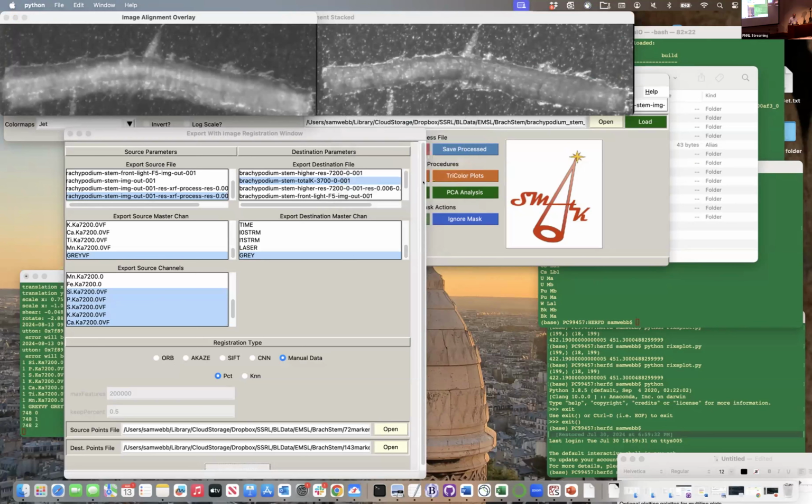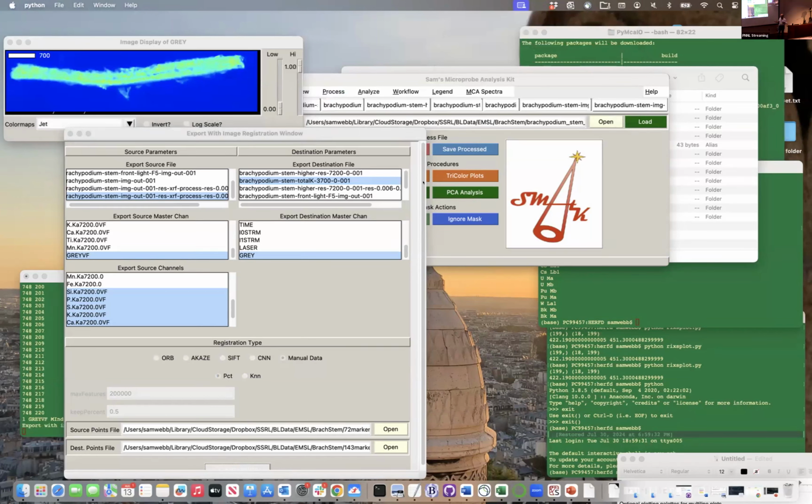We say yes. And now we've gone through. The one thing you see, it's going through a whole bunch of numbers on the left here. And this is actually a really important step. I can force that data from one map into another one, but now the images look great, but I've lost the registration of all my other data sets. So particularly if I have a spectra, an MCA data, a mass to charge, or an infrared spectrum, escaping me for a minute there. You still want to be able to show those raw spectrum, not just the bin data, right?